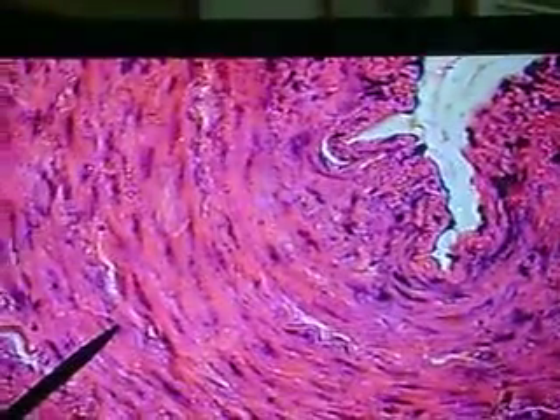So in the exam, many times we're asked to identify the internal elastic membrane. I would say this is a classic thing to encounter in an exam — a picture looking somewhat like this. So you're going into the exam and they're asking you, and this is what you see many times looking down the slide.